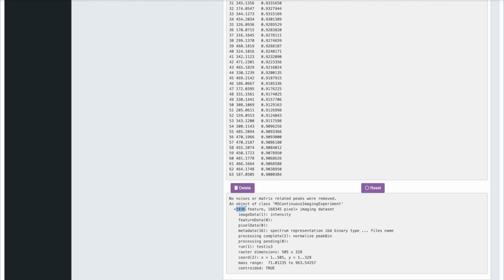Before removing the identified matrix-derived peaks, it is recommended to examine their distributions. You can visualize the distributions of several of these peaks, and verify if they exhibit a highly similar spatial pattern to the entered MZ value. This step ensures that the identified peaks indeed correspond to the matrix compound and can be confidently removed.